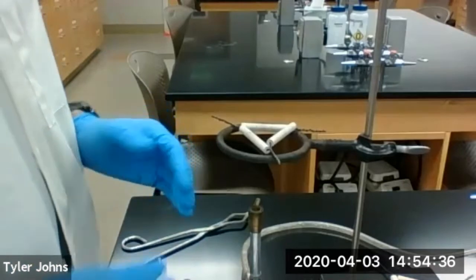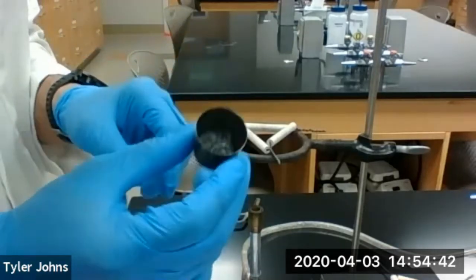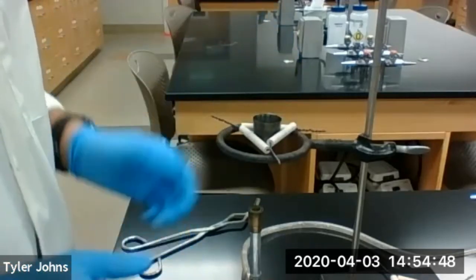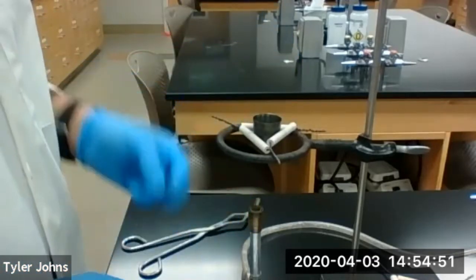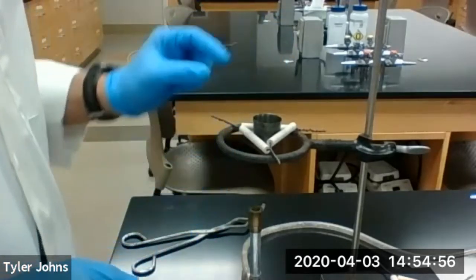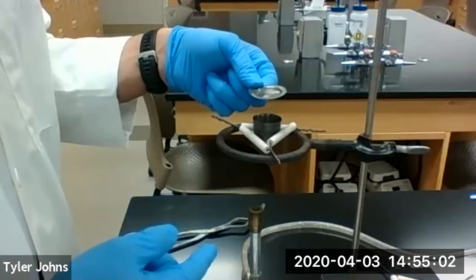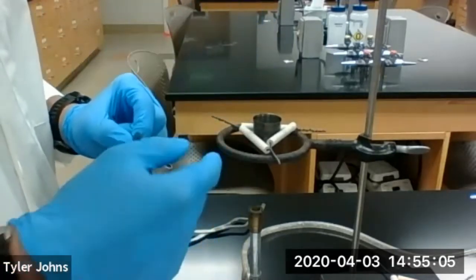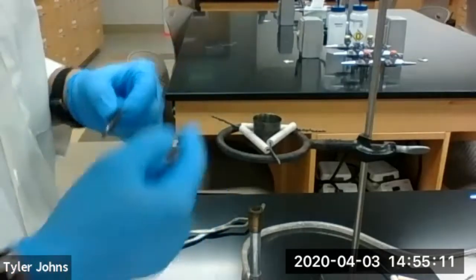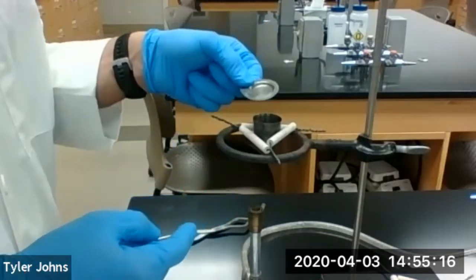For this next part we're going to start heating the crucible with the magnesium inside, set on our clay triangle. We're going to start heating with the crucible cover off. As soon as the magnesium catches fire, I'm going to put the crucible cover on and continue heating for about a minute or so. Then I'll remove the crucible cover, and if it catches fire again I'll put the crucible cover back on and continue heating. We'll repeat that process until the magnesium no longer catches fire when the crucible cover is removed.